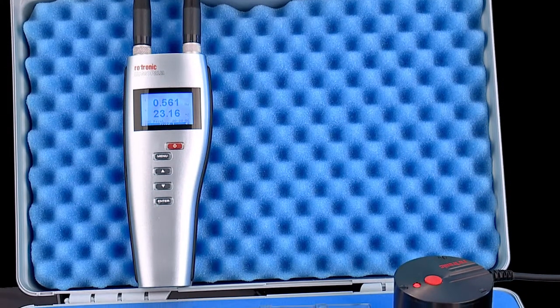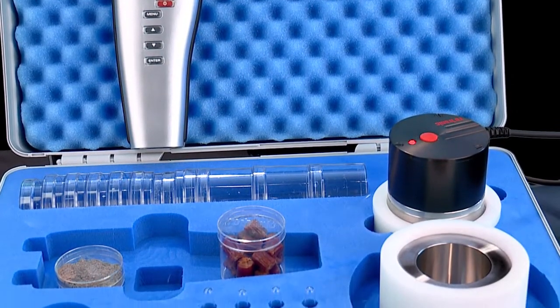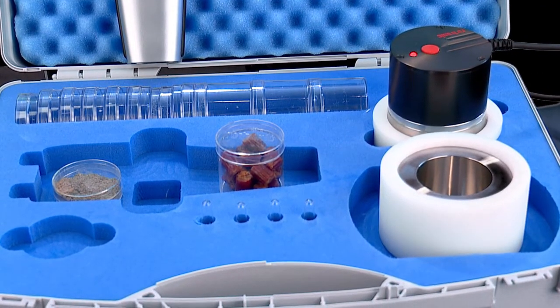The set consists of three main components: the HP23 AW handheld, the HC2 AW measuring probe, and the stainless steel sample holder.